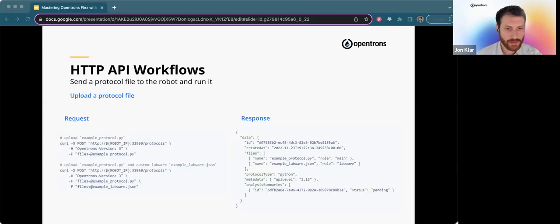So here, just have a couple of examples. This one is, the -h is your headers that you will be inputting in, and this one just needs the Opentrons version. Most of them require the Opentrons version. This is the version of the software that is on the robot, and you can get it straight from the robot, but the easiest way to get it is going to be through the official app. Load up the app, whatever version of the application you're using to control the robot, it will push that version of software to it, and then you can look it up there.